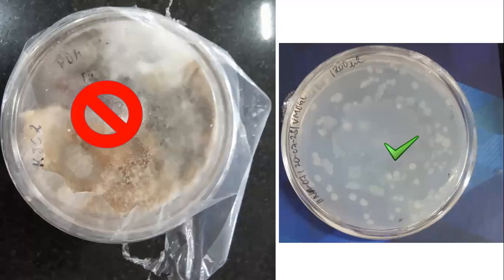And regarding wrapping, there has always been a debate whether to wrap the plates or not. I have conducted very basic research to see the effect of wrapping on the growth of various bacteria. I will share that link along with this video. You can check it out. There is not much difference. Especially in academic settings, if you wrap a plate, first of all, your plates will be safe from Drosophila melanogaster. Even if many people incubating their plates along with yours are not wrapping, they will attract Drosophila, and this will also put your plate at risk. So better wrap the plates.